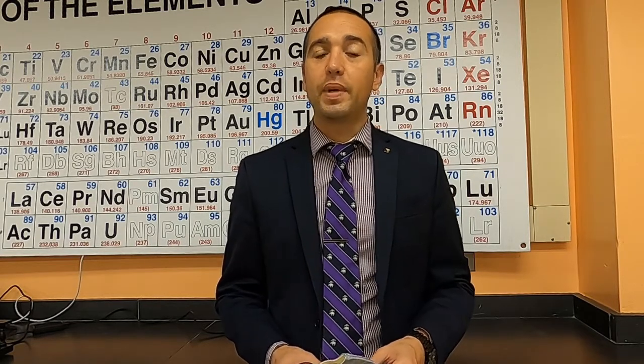Hey everybody, today we're going to be going over how to do and analyze our mini lab activity about the density of metals.